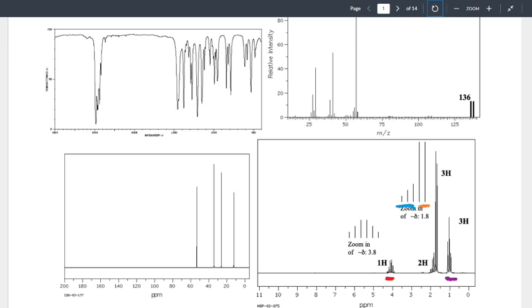The multiplicity is now the number of peaks. So let's take a look at the red signal. The red signal is probably the easiest of these because we've got a zoom in of it, but we can go through and now count the number of peaks. How many peaks do we have? 1, 2, 3, 4, 5, 6. We got 6.